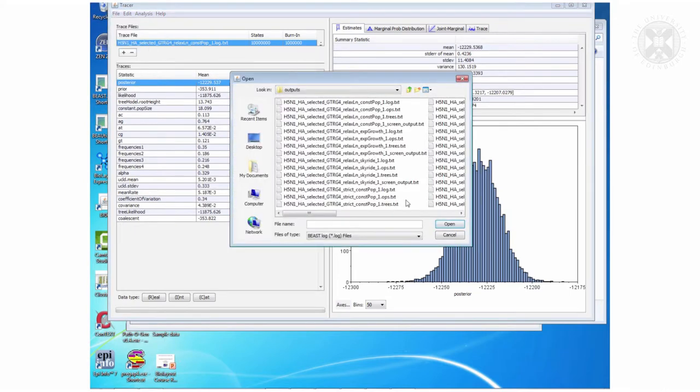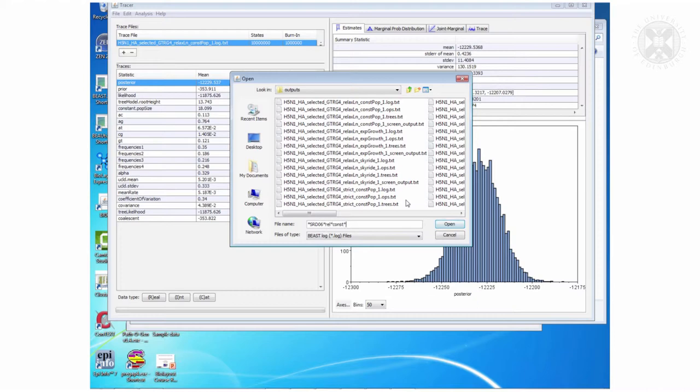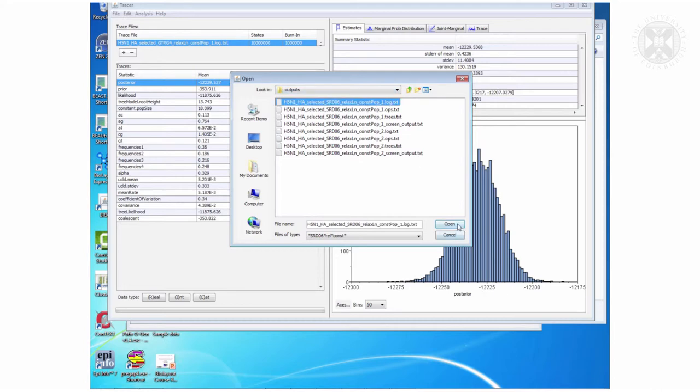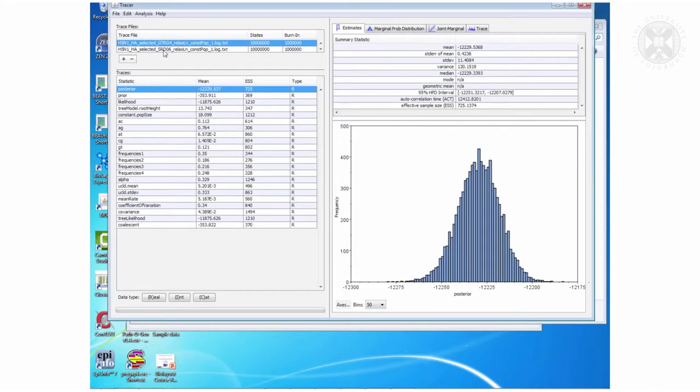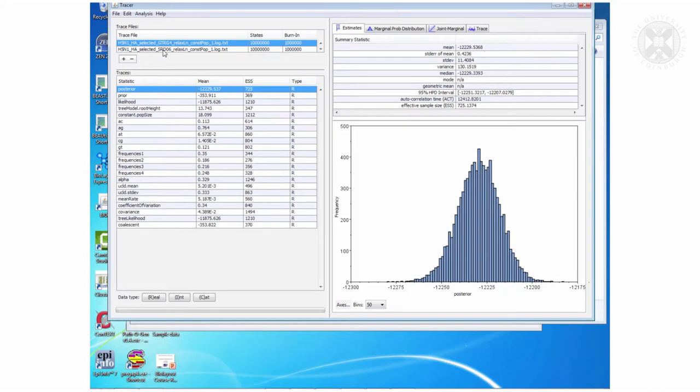So now I will open similar in fact the one you generated and now if I click both of them I can compare.